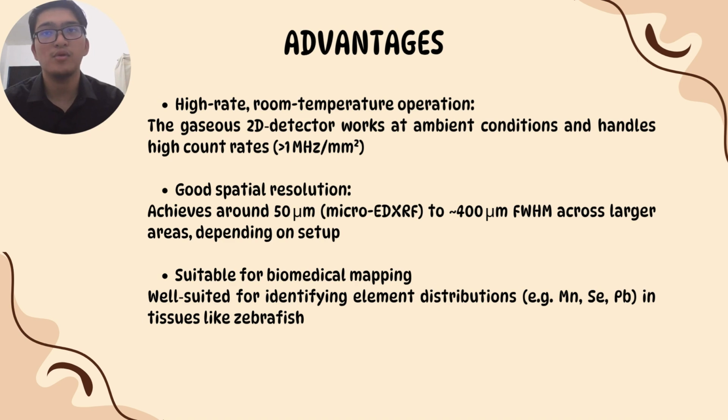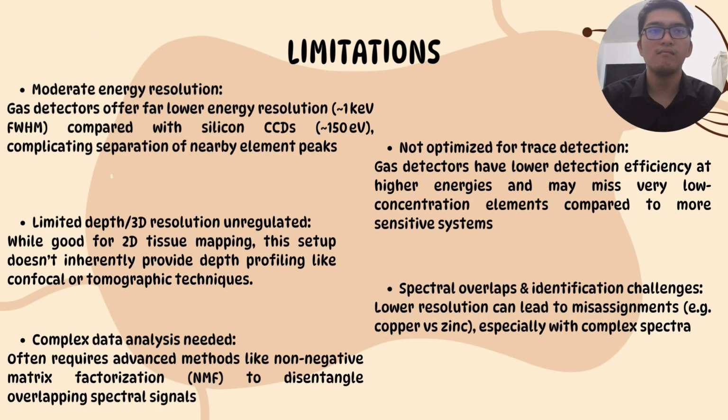And lastly, it is suitable for biomedical mapping, which means it is well suited for identifying element distribution, for example, manganese, selenium, or lead in tissues like zebrafish. Next part is the limitations of full-field X-ray fluorescence spectroscopy. The first one is moderate energy resolution.